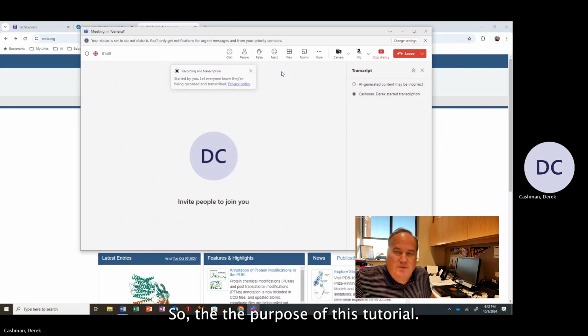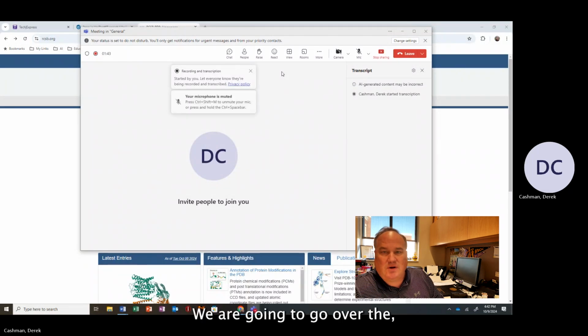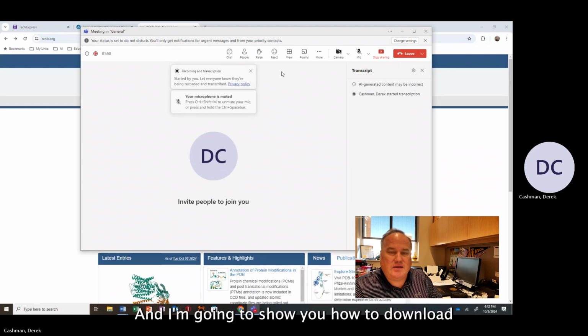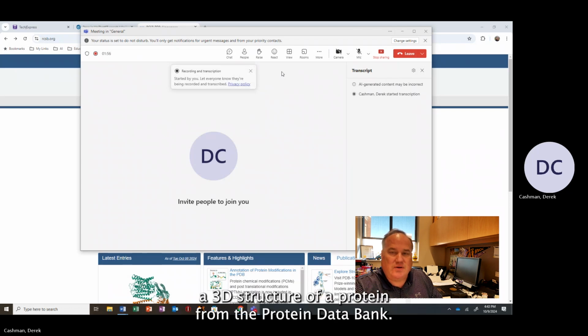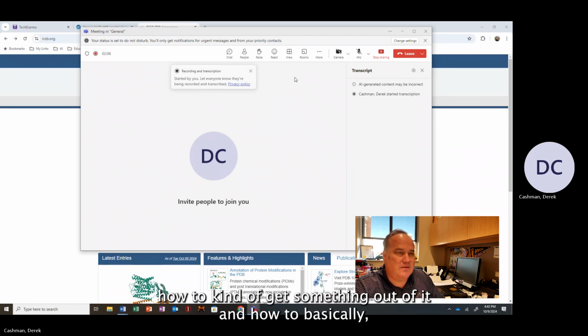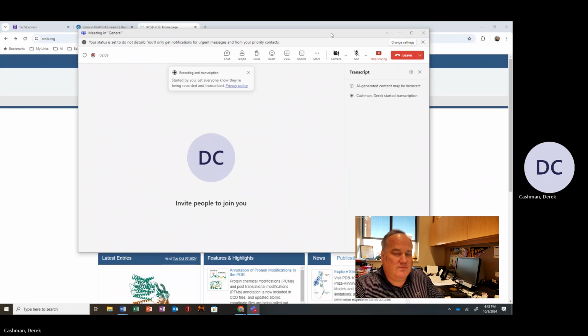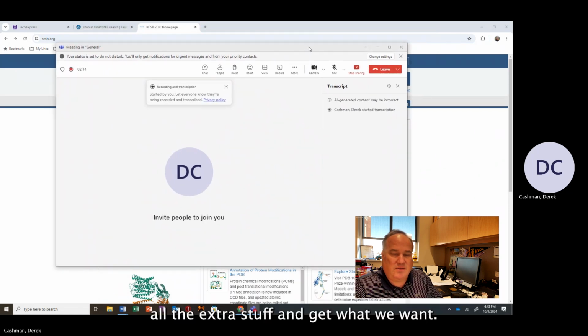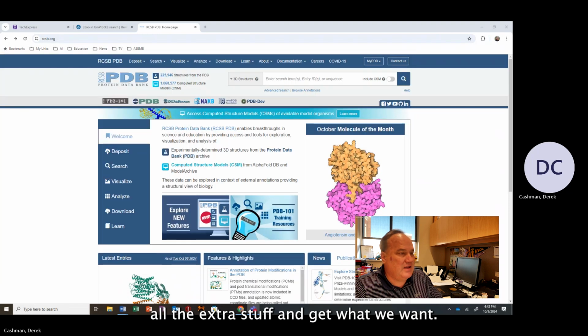Welcome. The purpose of this tutorial is to go over the program UCSF ChimeraX in molecular modeling. I'm going to show you how to download a 3D structure of a protein from the Protein Data Bank, and we're going to illustrate how to get something out of it and how to visualize the protein so that we can minimize all the extra stuff and get what we want.